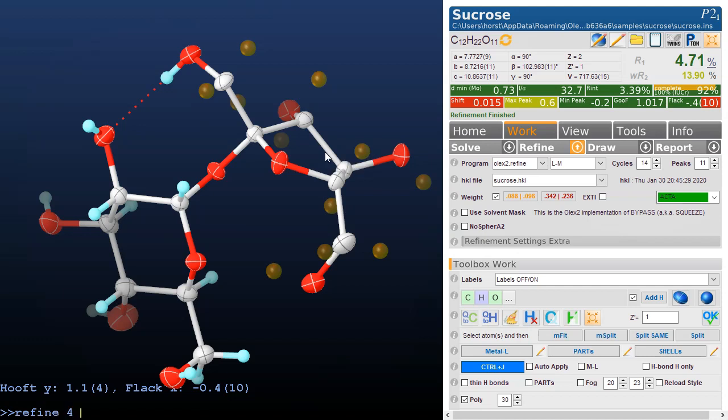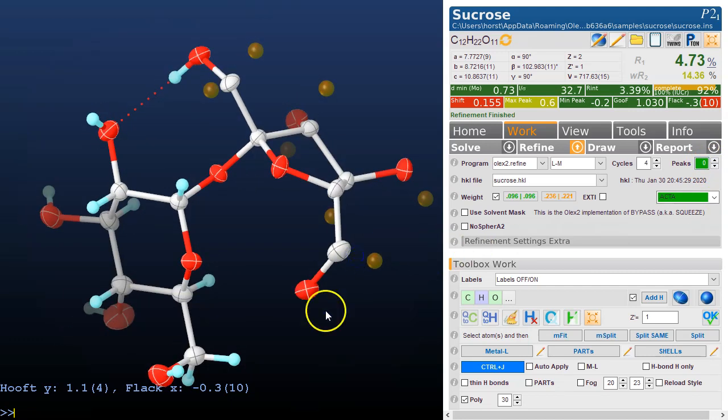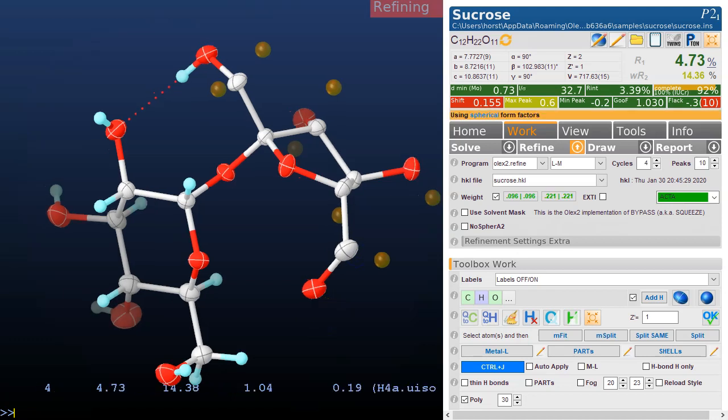If you want to see seven peaks, then this is what Olex2 is going to do: four cycles and seven peaks. Now if you want the automation back again, then you just set this all the way down to zero. If I refine this now with Ctrl+R, then Olex2 will again calculate how many peaks are actually required, how many hydrogens are missing. So it's up to you, take it or leave it. If you don't change the number you will always get an estimate by Olex2. If you change the number then it will stay.